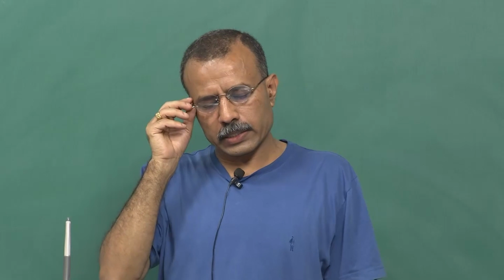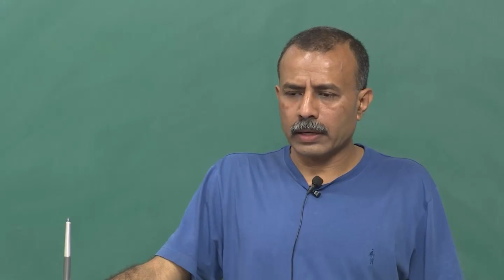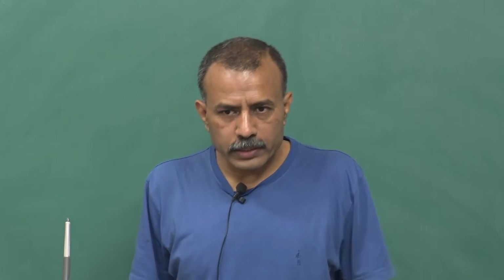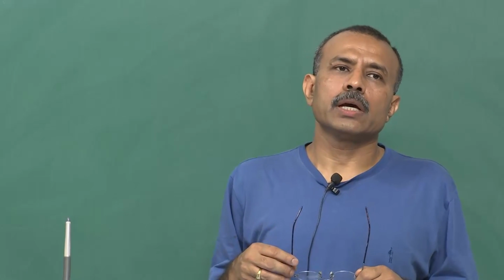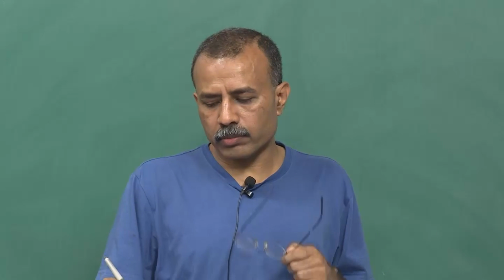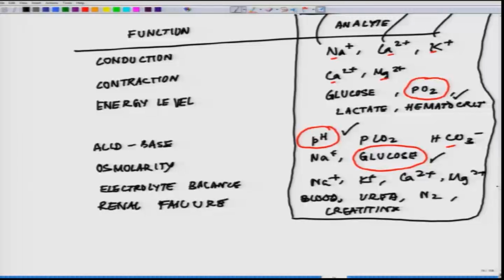The lecture series on bioelectrochemistry. In the last class, I highlighted the different kinds of analytes which could be evaluated or measured in the biological platform, especially in the critical care unit, and we talked about analytes like sodium, calcium, potassium, magnesium, oxygen, pH, glucose.